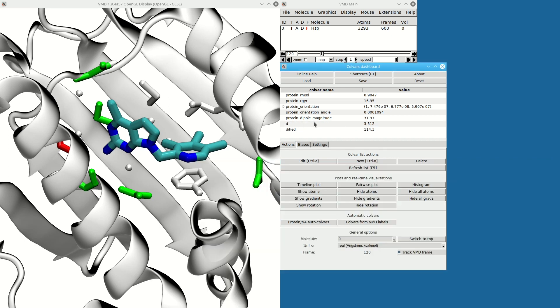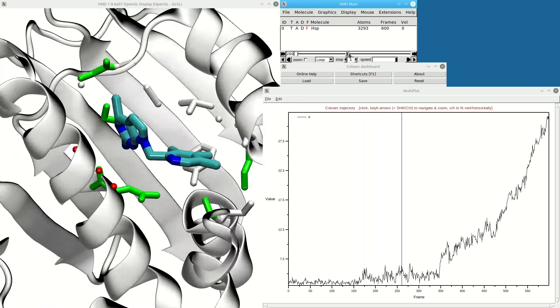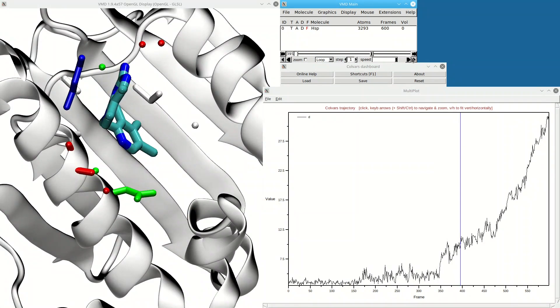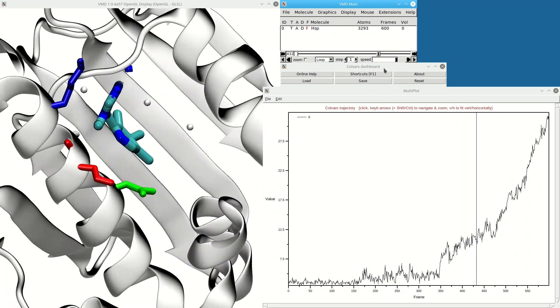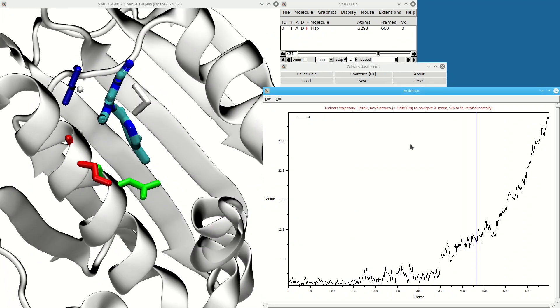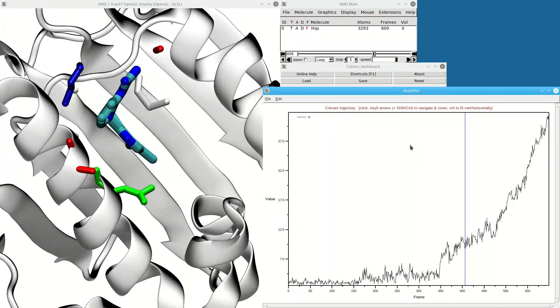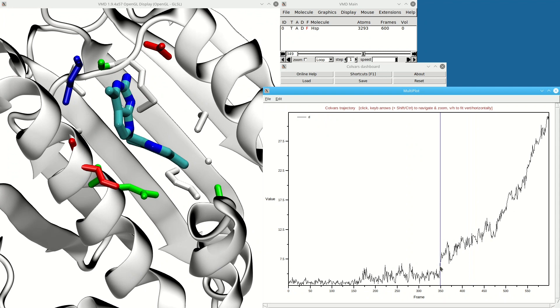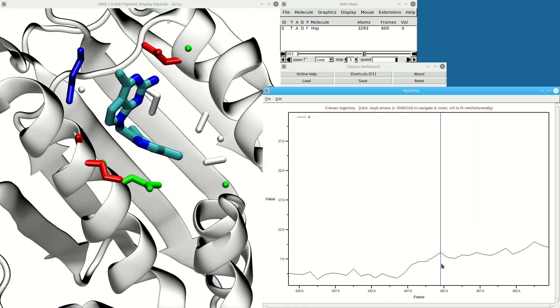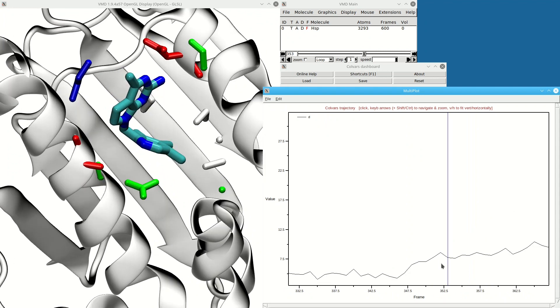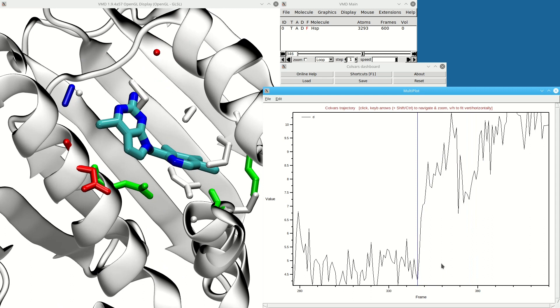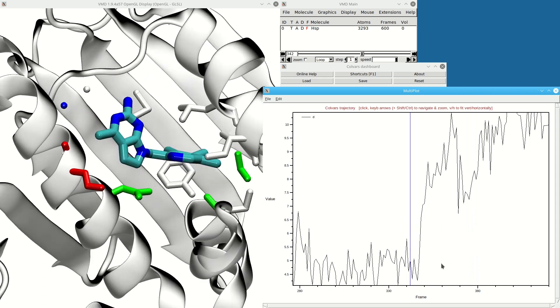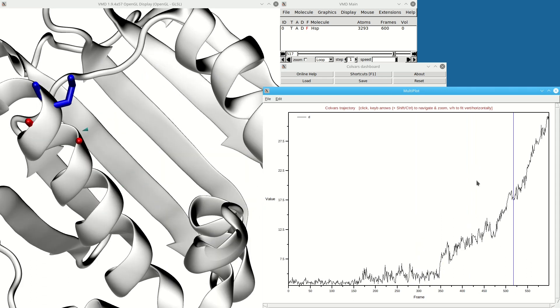Now the timeline plot will show me what I expect—the time evolution of the variable. This blue cursor tells me where I am in the trajectory. If I click in the plot and navigate using the keyboard, I can also navigate the Colvars graph, and that takes me to the right place in the molecular trajectory.